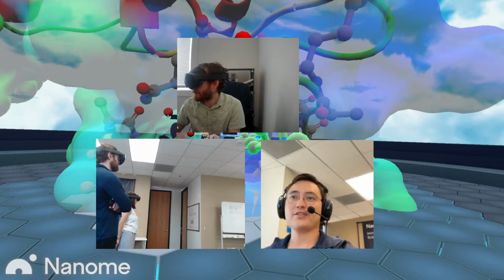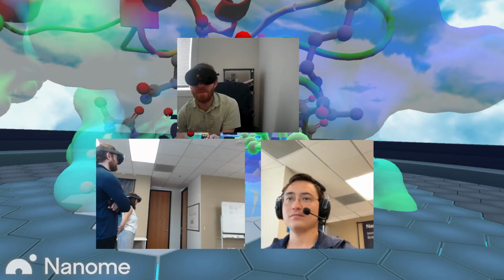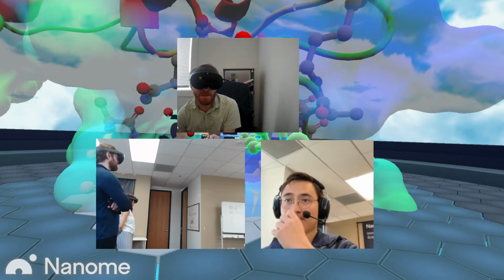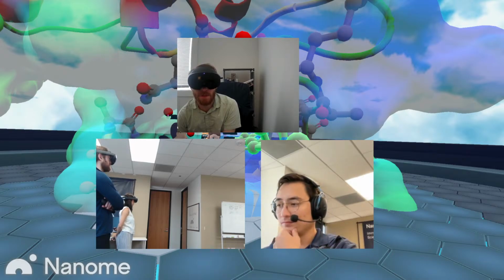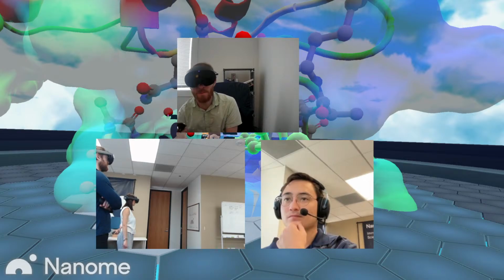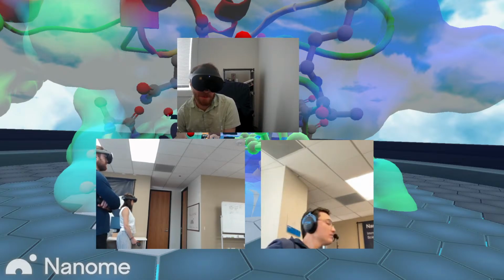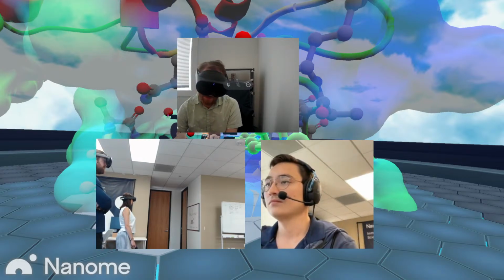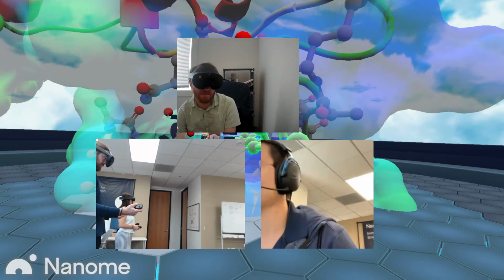Have we tried to connect to a molecular dynamics engine through IMD and test some steering experiments? I would say you can bring results in for something like that with Nanome. I've done a number of molecular dynamics calculations and other things like that, and then brought them in with my data to understand what's going on. With the web browser, I can bring in slides, PDFs, and other graphs along with my structural data. So the answer is I've brought in other types of data that are similar. I haven't brought in that exact kind, but I'd be more than happy to show you how to load those in.